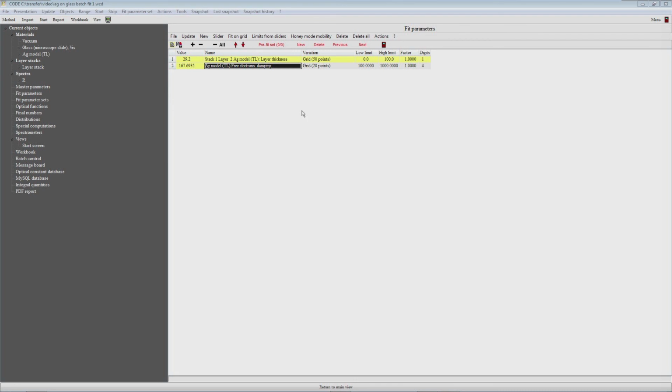That is obtained when for every one of these 50 grid points, we try every 20 points here for the damping. So that would mean we have 1,000 iterations. Since the iterations are pretty quick, we can nevertheless do that. We can do 1,000.